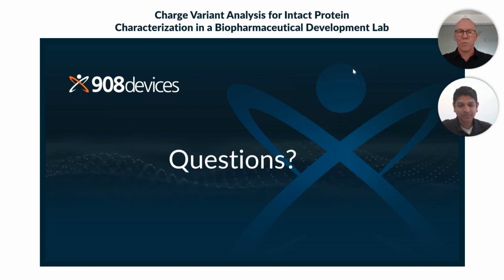So the question is, how do we correlate that with what we are seeing in ICE, where we don't have any assignment? I have to repeat what I said. It's about seeing the similar profile being obtained, and from that you can infer that they are correlated.